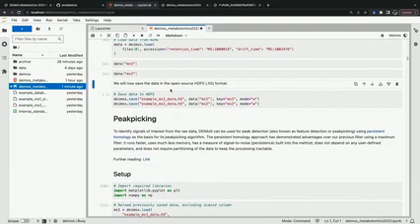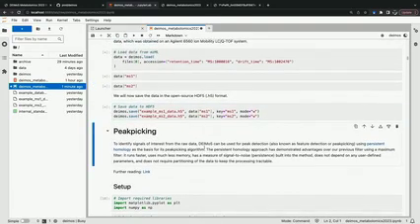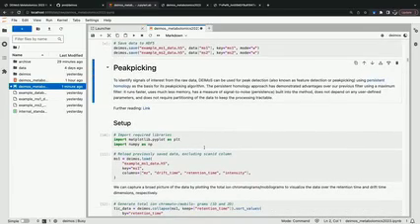While the data is loading, and I guess we'll run the saving cell as well, I'll just move on to discussion of peak picking. To identify features in your data, DEIMoS can perform peak detection. We went through a few iterations of different peak picking algorithms, but the algorithm that we currently settled on as the default for DEIMoS is using persistent homology as the basis for signal detection.